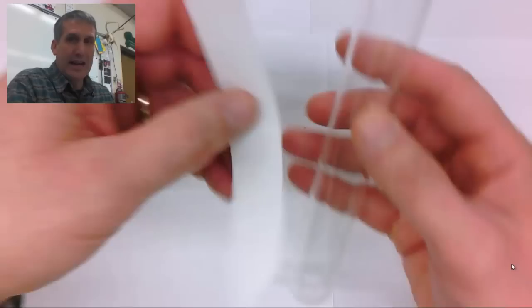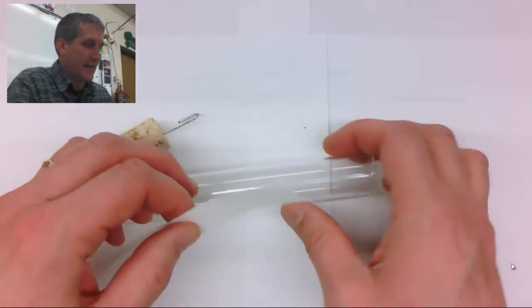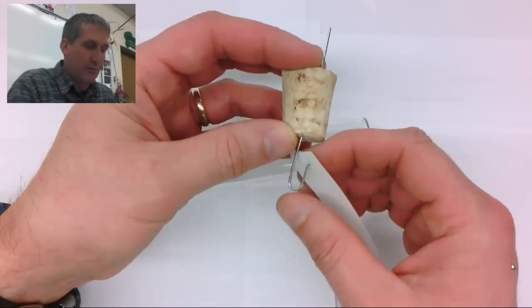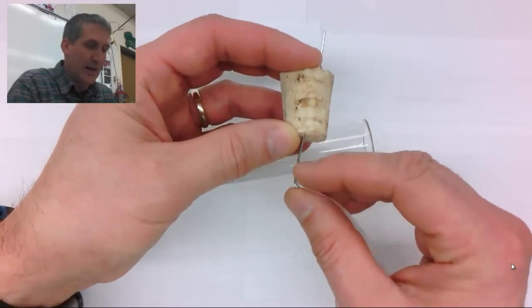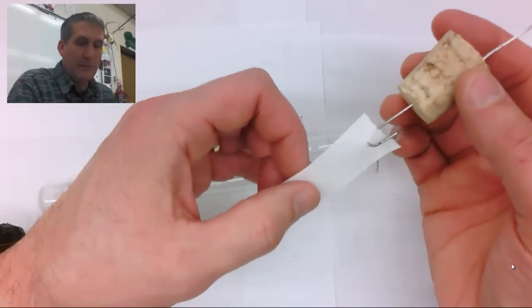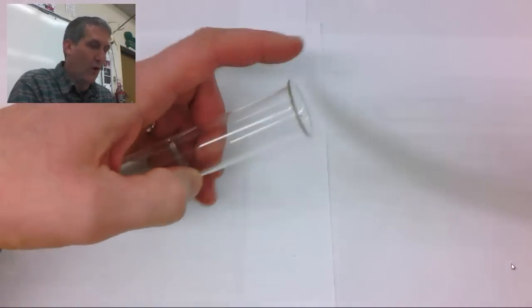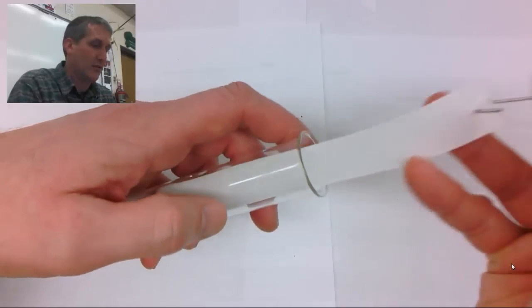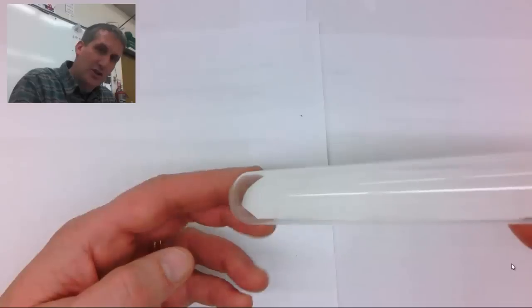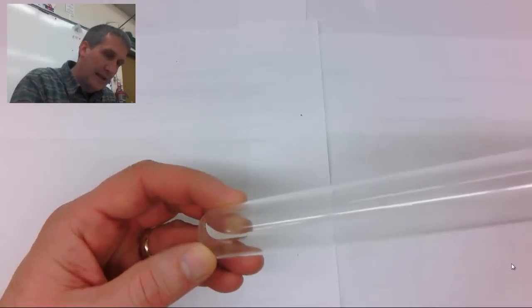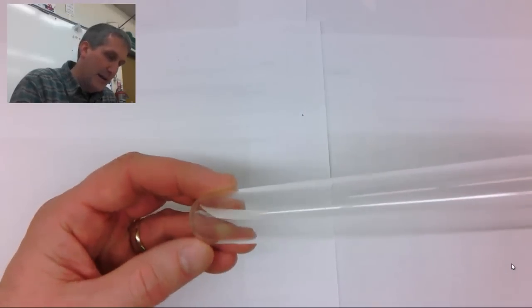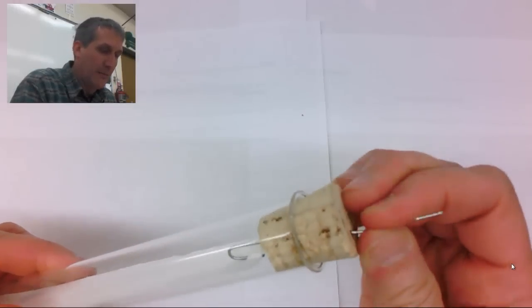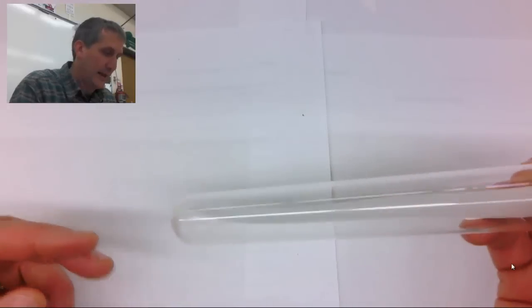Now at this point you can go ahead and fit it to see how it's all going to work together. You put the chromatography paper on the paper clip hook and then put the whole piece of chromatography paper inside of the test tube and check to make sure that the point is all the way down at the bottom. If you need to make some adjustments you can pull up on the paper clip a little bit to make minor adjustments.